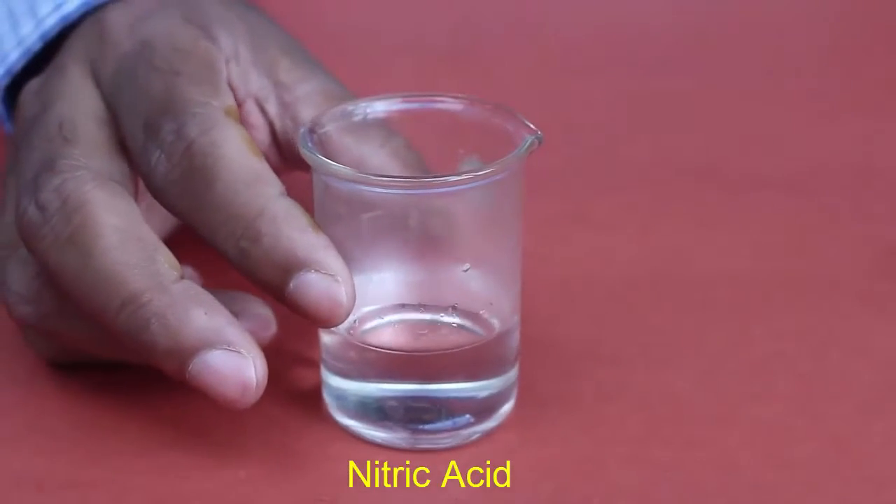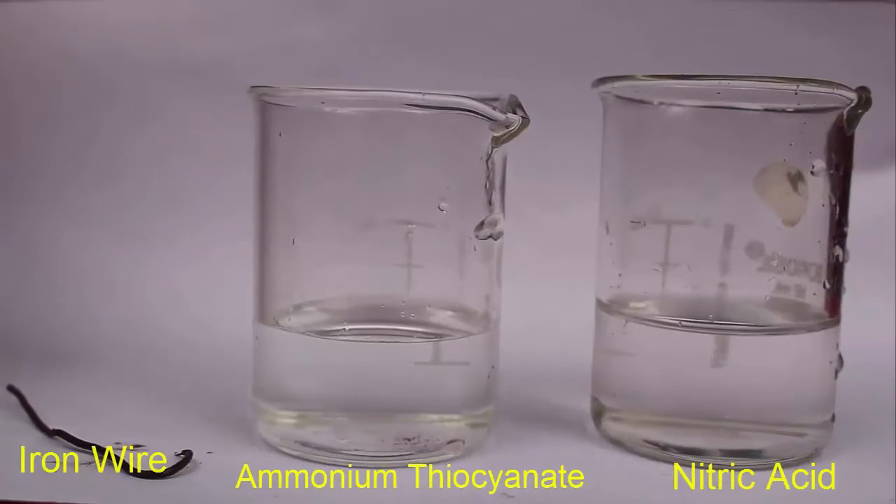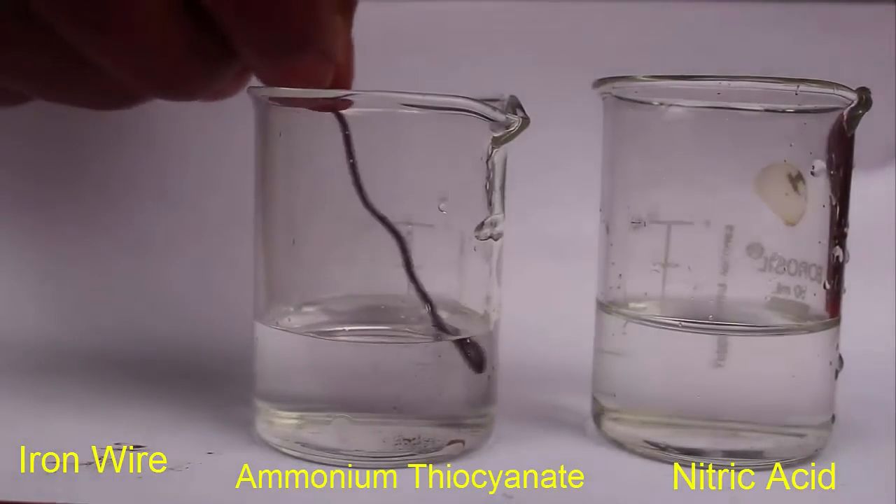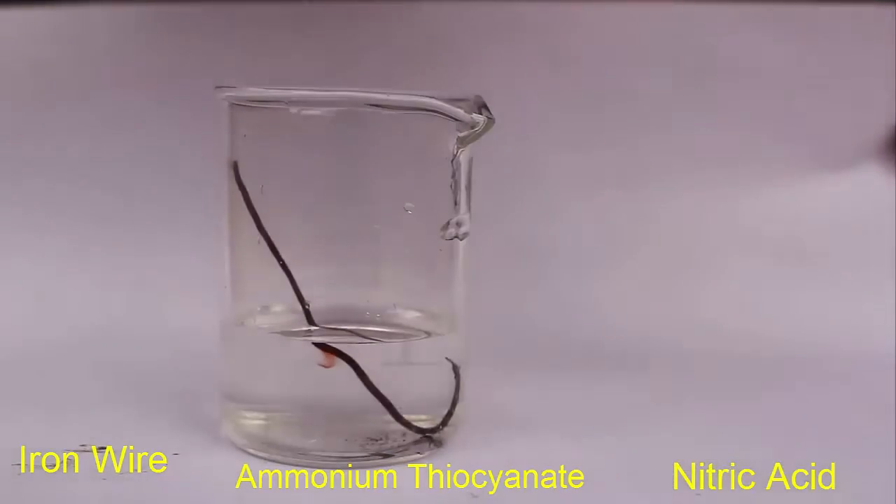Now place some nitric acid in another beaker. On the right beaker we have nitric acid, and on the left we have the ammonium thiocyanate solution.